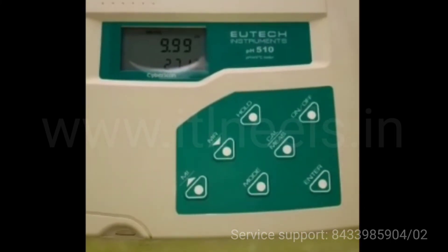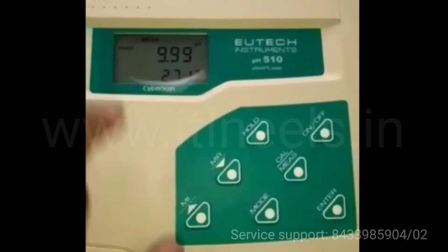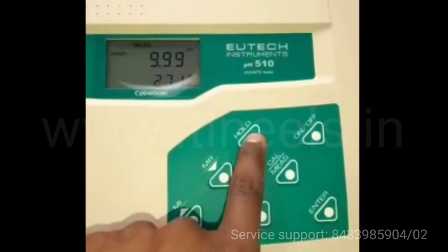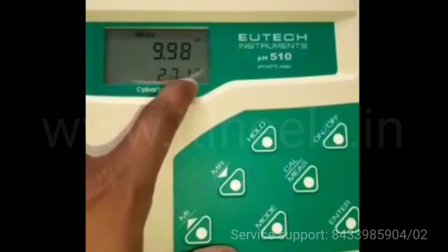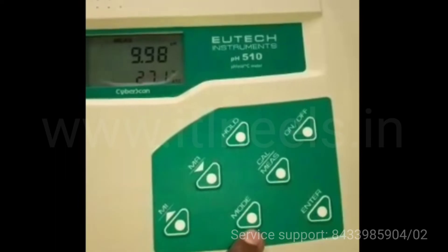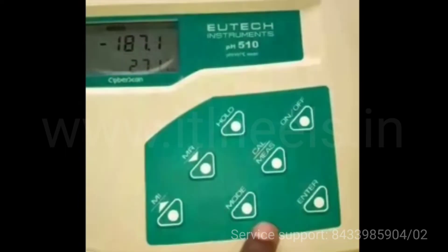After completing 3-point calibration, it automatically comes to the measurement mode. If you want to hold this reading you can press hold. At the bottom the temperature is shown. If you want to change the mode you have to press mode, then it will switch to mV and again pH.